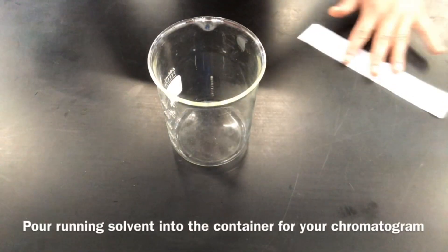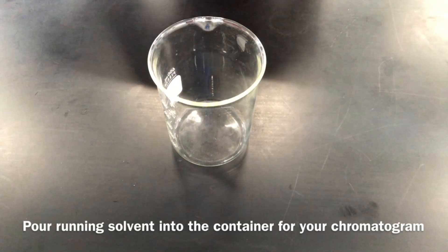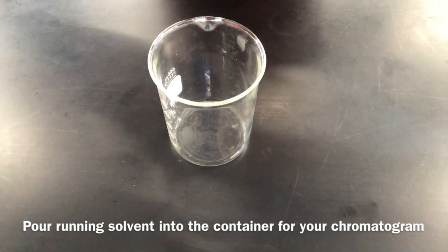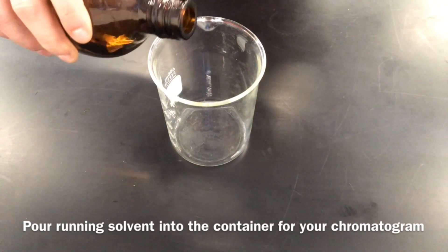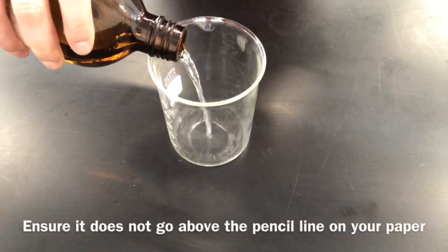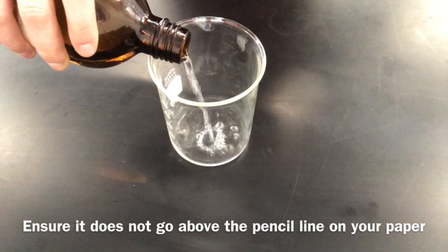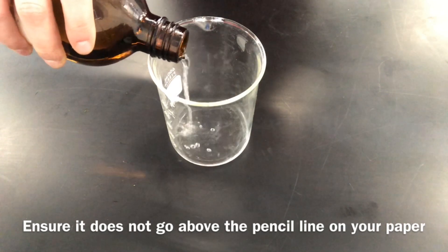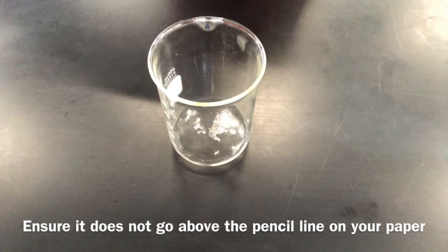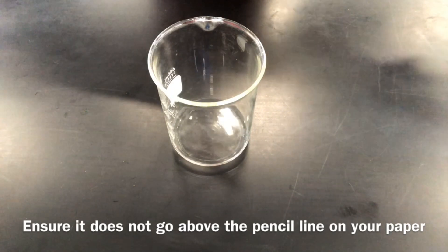The next step is to prepare your running solvent. Take the container in which you will place your chromatogram and pour your running solvent into it, ensuring that it does not go above where the pencil line is — so not above two centimeters from the bottom of the container. There are a variety of different running solvents people use; one of the most common is nine parts petroleum ether to one part acetone. Your teacher might give you a different solvent, but you would perform the same actions with whatever solvent you are provided.